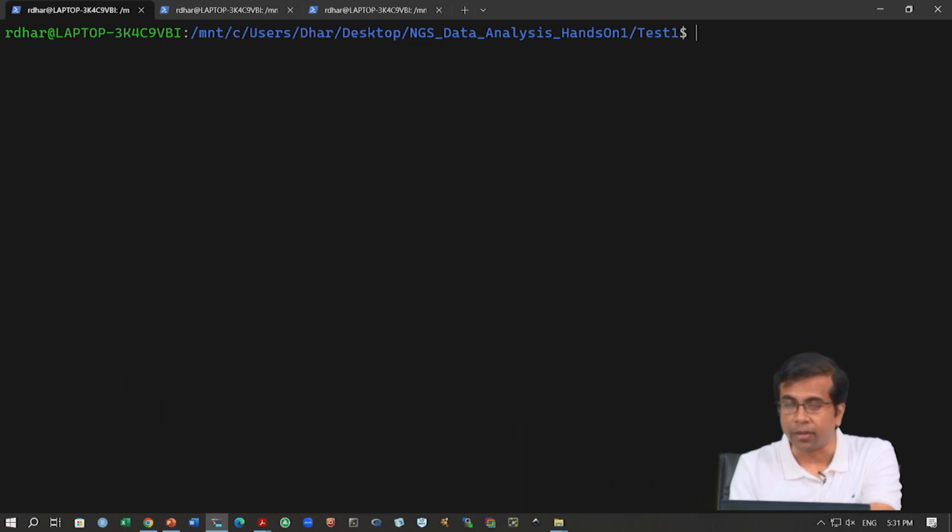All right. So, one of the things you will probably notice is that calling them through this dot slash is actually quite cumbersome. Every time you have to direct them to the folder where they have been extracted. If you go out of this directory and go somewhere else in this system, you have to point to the directory where SAMtools has been extracted and call the command SAMtools. Is there any way you can call SAMtools from anywhere in the system? It turns out there is.